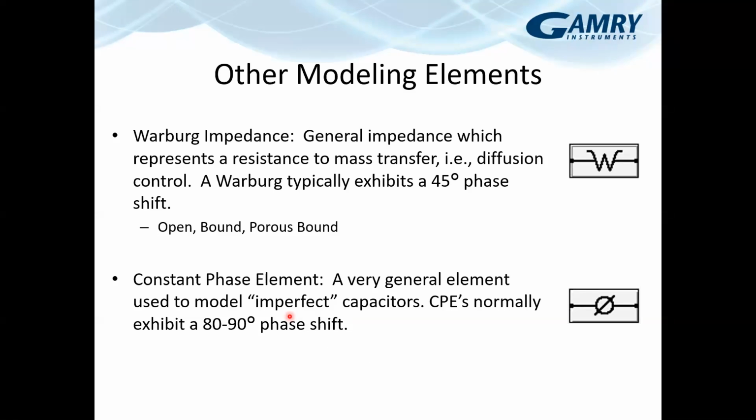They can have hot and cold zones if you're talking about something where you can get an oxide film or a barrier that is in different areas of the electrode. So the electrode surface itself is rarely completely planar or completely uniform in terms of its activity. And so how that gets reflected is in terms of this adjustment to the capacitance of the electrode, and a constant phase element gets used in that place.